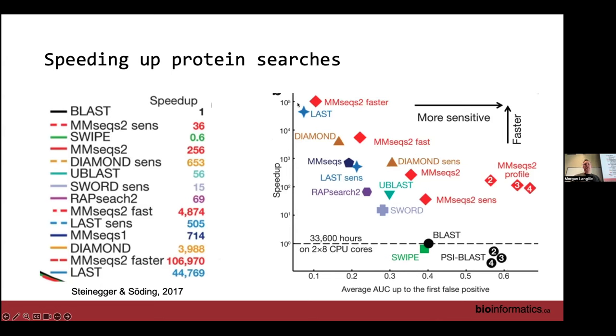In a single genome, you could say, okay, at least 60% of the pathway has to be there because you've sequenced all of it. Say you have a pathway with only 20 genes and you observe two of those genes in the community, you could count that pathway as two. By default, you would just do that, and the number doesn't really mean anything. You could just use that as a scaling factor. But I think most people would agree that if you only have two out of the 20 genes of a pathway, we probably shouldn't report that as being there. But of course, then it gets complicated, right? So what about 10? What about 15?